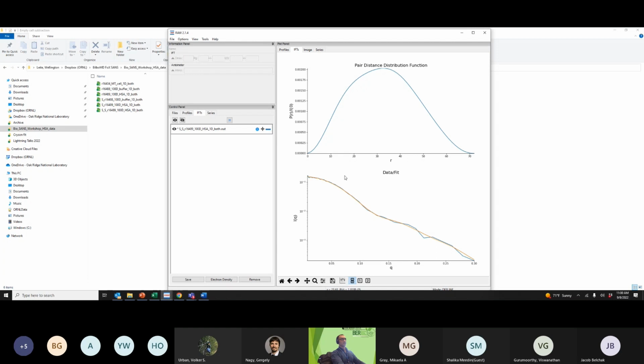You can see here it is already normalized by I0. In general, if you have different P(r) profiles, there are different normalizations that you can use to compare them. One of them is normalized by I0, which RAW already does in the calculation, but it's common, it's necessary, to normalize by the area of the P(r). Basically the area is proportional to the number of particles you have there.